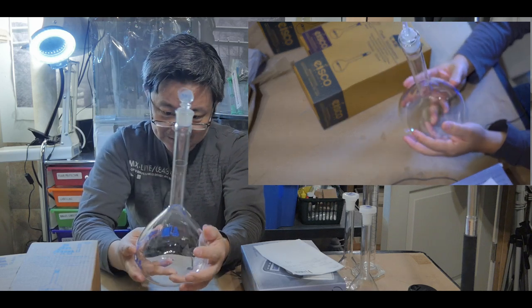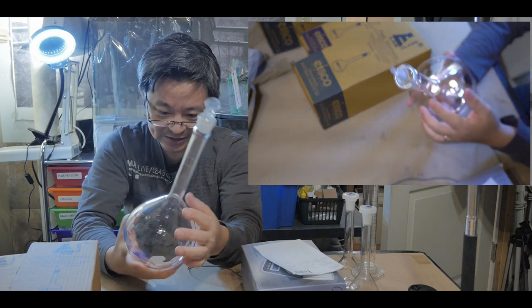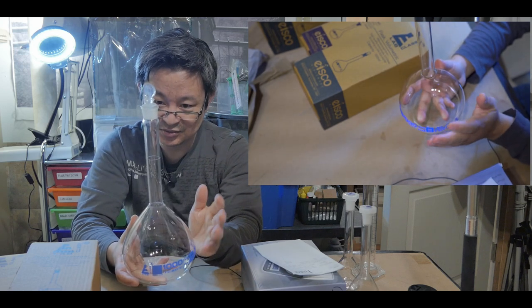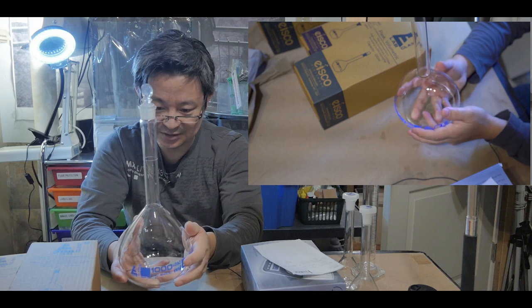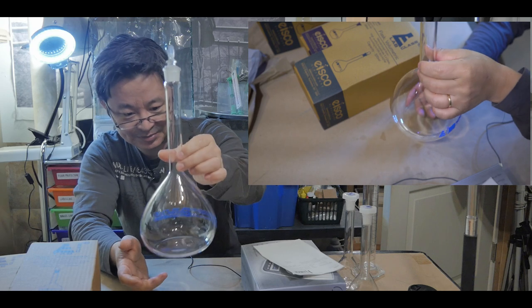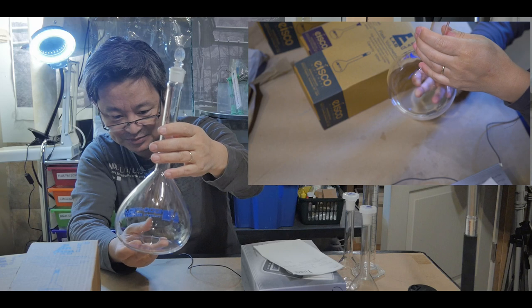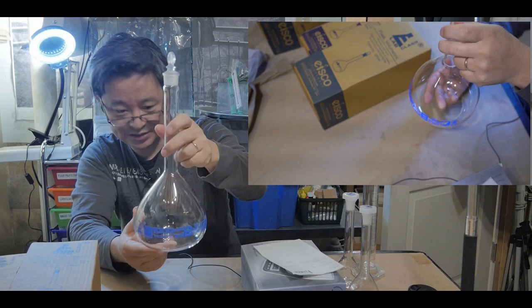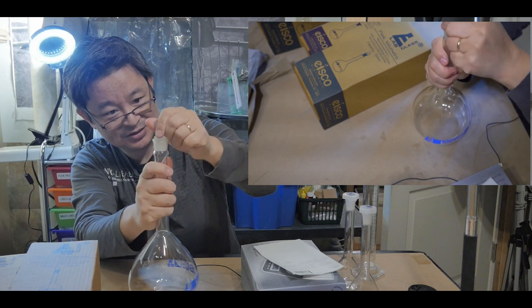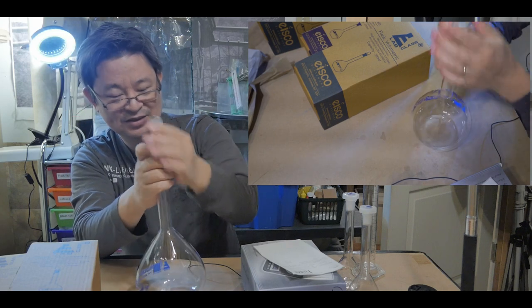And since I'm not putting in a hot liquid, I think it should be fine. As long as the temperature is room temperature, it's cool, between three degrees all the way to like 50 degrees Celsius, I think it should be okay. It wouldn't affect the crack or anything like that, so I'm okay with that. You know, it only cost me about ten bucks to buy this 1000 milliliter plus and minus point six volumetric flask. I love that. Wow, look at this. Let's try to get that out. Well, it's so tight. I think they put some kind of - I'm going to try - oh, I'm not going to pull it out right now. I might break it.